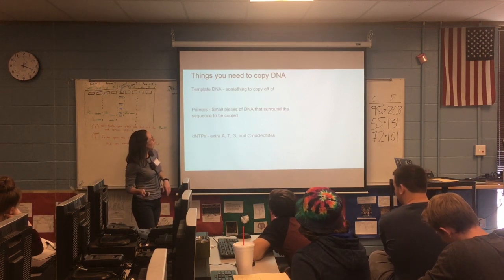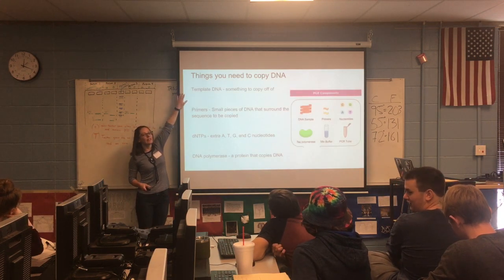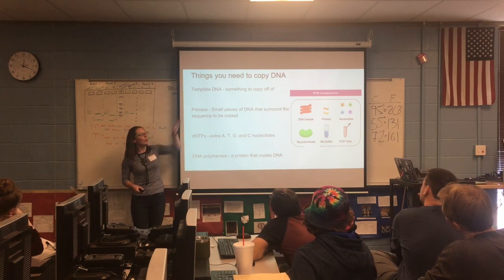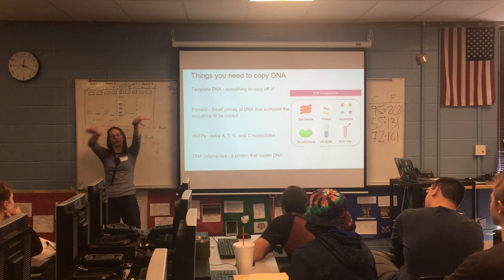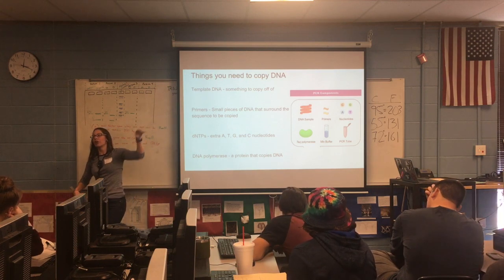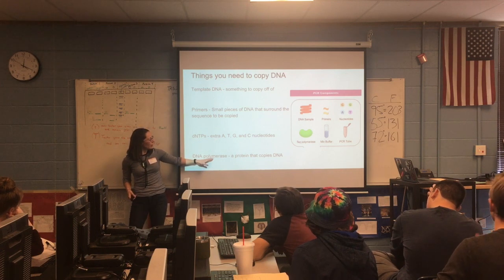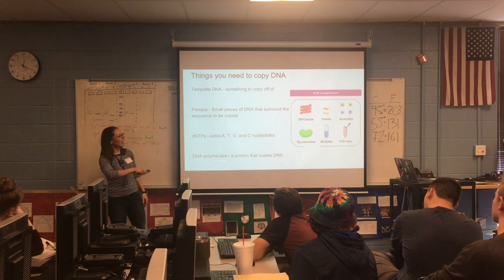So let's go through these real quickly. Template DNA, this is going to be your GFP DNA, your plasmid. Primers, I'm going to give them to you. One's going to go one way, one's going to go another way. One has a mutation on it, the other one doesn't. dNTPs, I'm going to give you, and then DNA polymerase, that protein that actually does the copying.